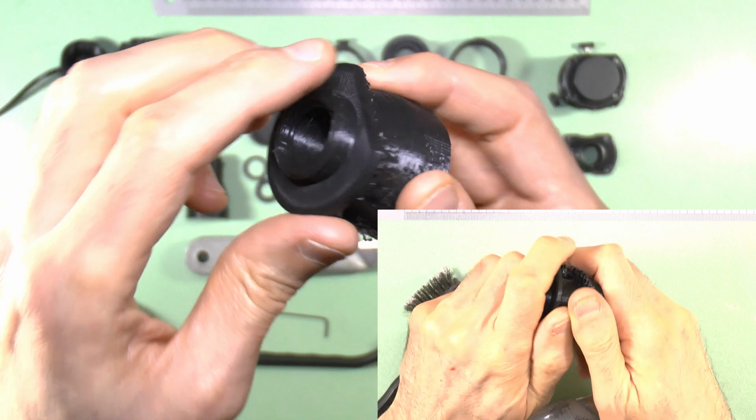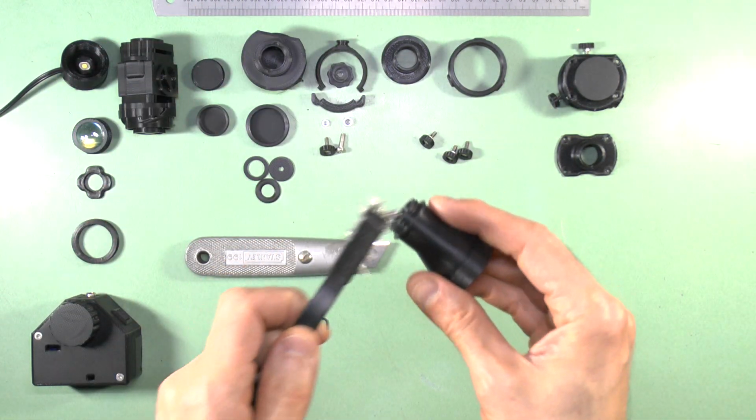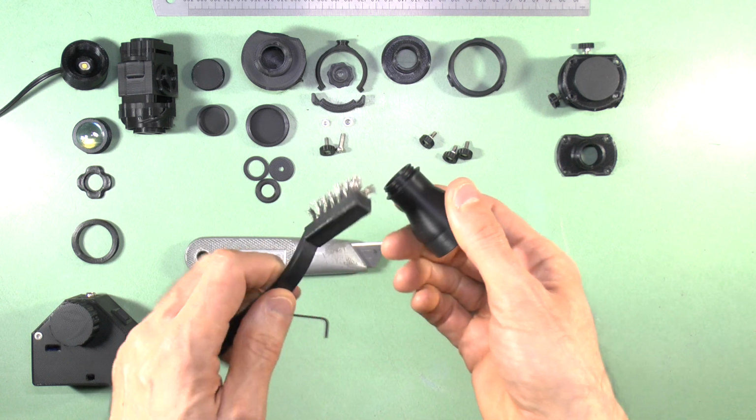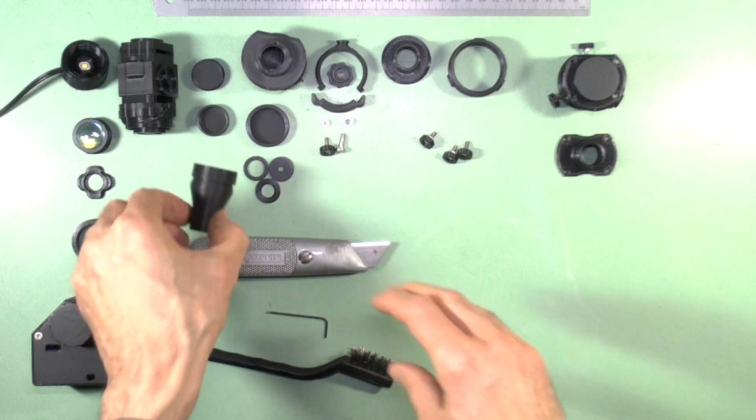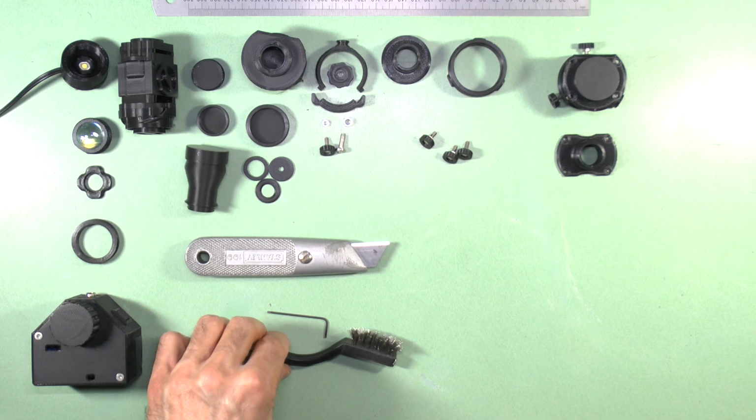Ensure any printed thread mechanisms are clear, and these may need to be scraped and finished with a wire brush to ensure they work as intended. Make sure any dust produced by these cleanup procedures is removed prior to fitting any optics.